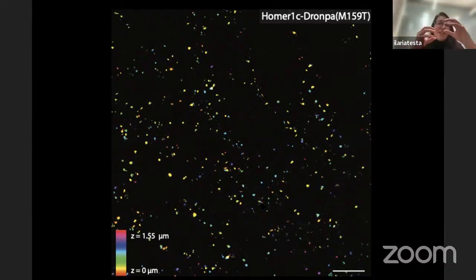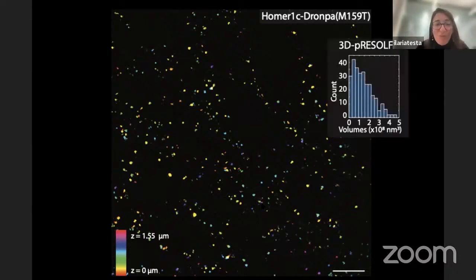But then you see that they are basically first floor and last floor, so they're not actually so close to each other. You have a lot of those artifacts if you live with projection, ignoring completely the axial resolution. So you have to think about that.